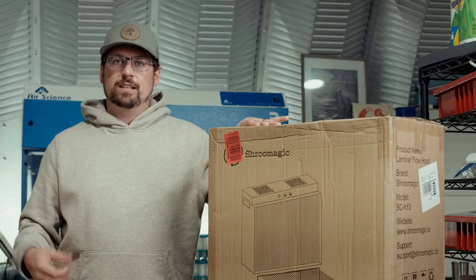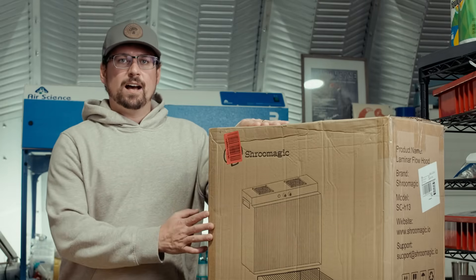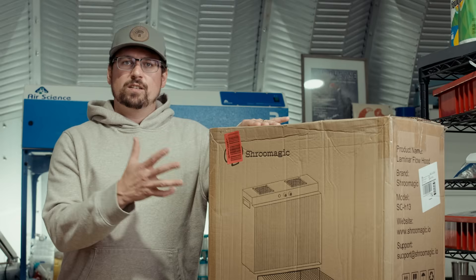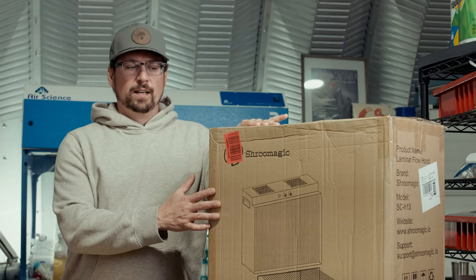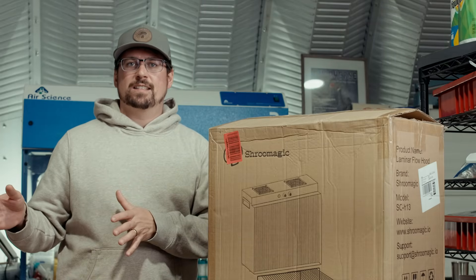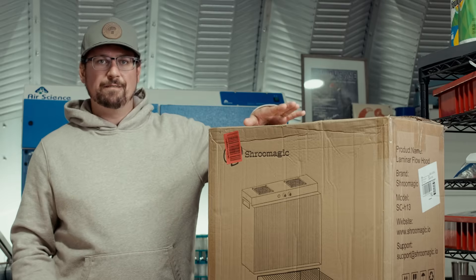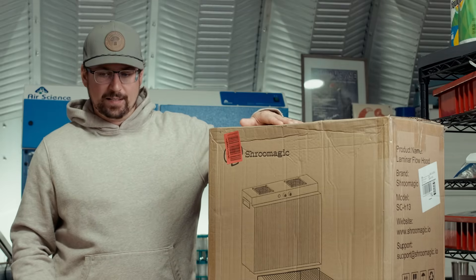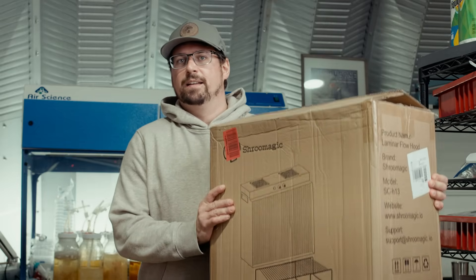This is really cool as a hobbyist grow setup. My vision is someone who does one or two grows a year could pull this out, do their petri dish cultures, do all their grain spawn inoculations in front of this flow hood, then box it up or cover it and put it in the closet until the next grow session. It's really convenient, fits on a four-foot table, and it's super lightweight.